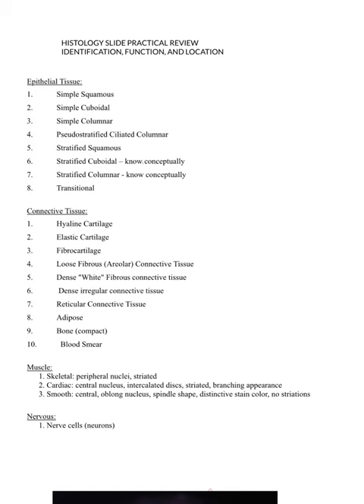This video will prepare you for a histology slide practical. You will be able to identify these epithelial, connective, muscle, and nervous tissues, as well as be able to describe their function and give one location where they are found. Okay, so all of these things here are going to be included. They are not going to be in this order though.